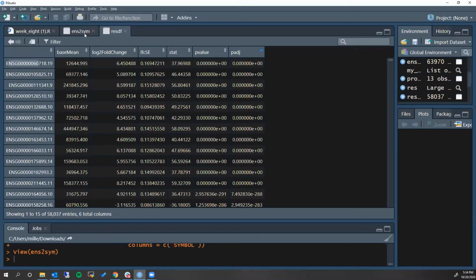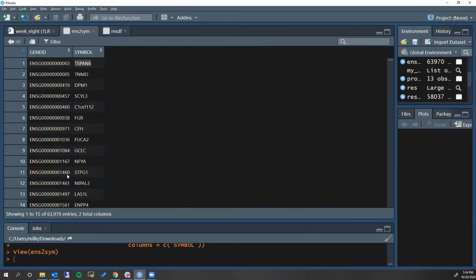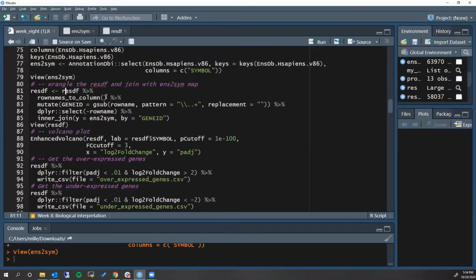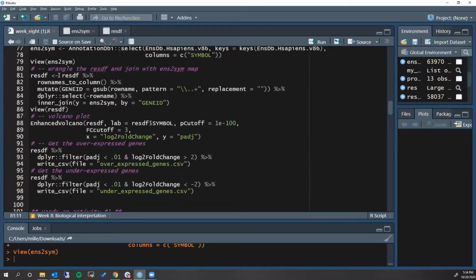The first issue you might notice is that when we look at our row names here, you've got this dot number, like dot 11, dot 9, dot 10. And when you look here, you don't have that. So how do you deal with that? The easiest way is just to find these dots followed by numbers and remove them. That's what we're going to do in this section.